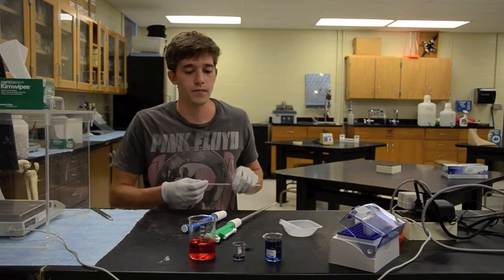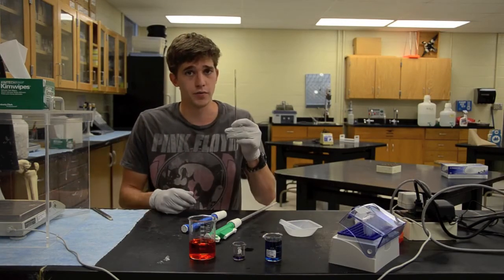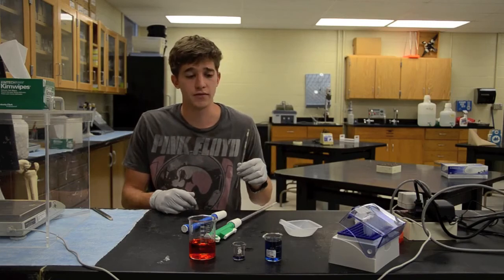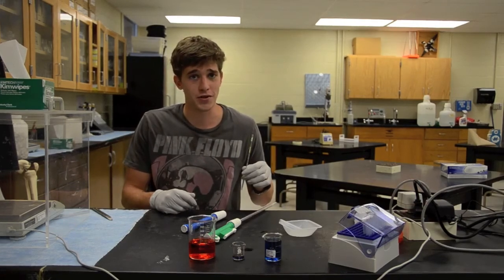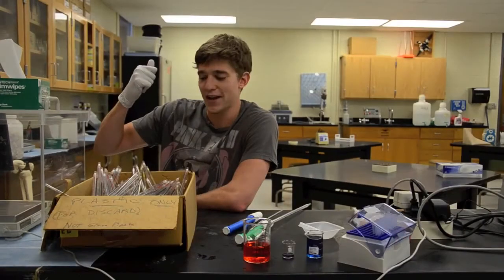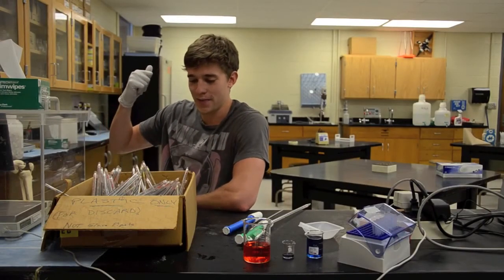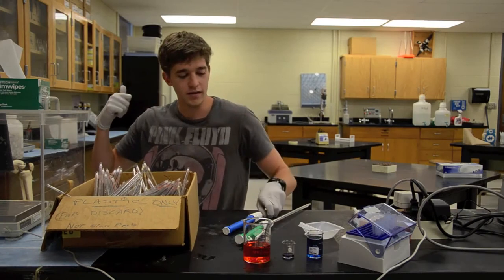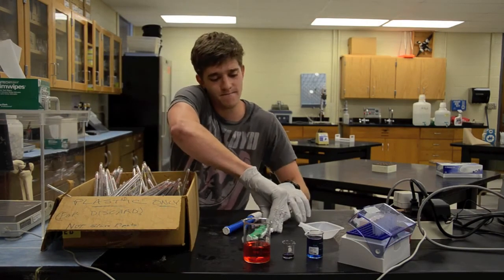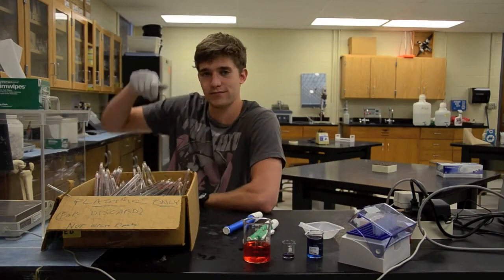Now, unlike high school, these are disposable. So whenever you take something from one liquid to another, you have to dispose of it afterwards. To do that, you're going to discard it. You're going to throw it away in the proper box. And looky there, the plastic pipette discard box, where we will conveniently place all of our used plastic pipettes.